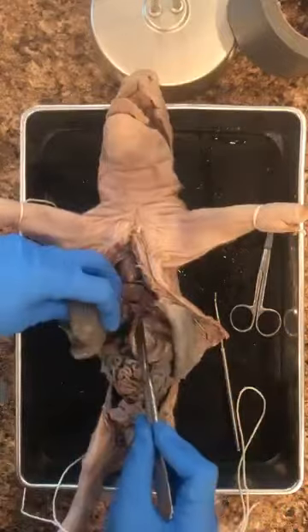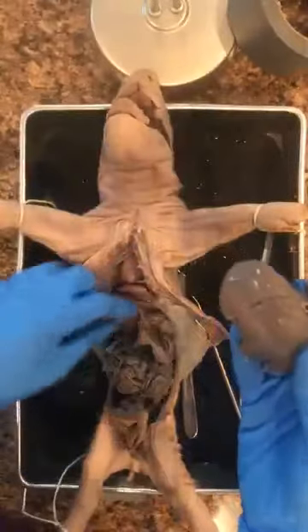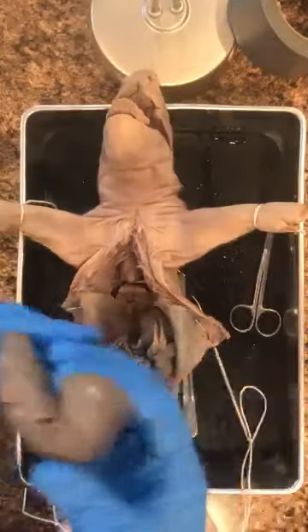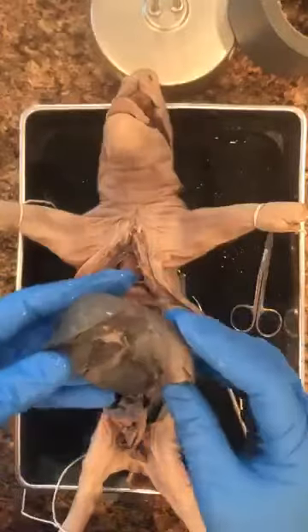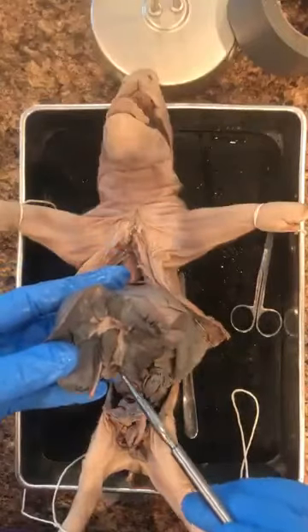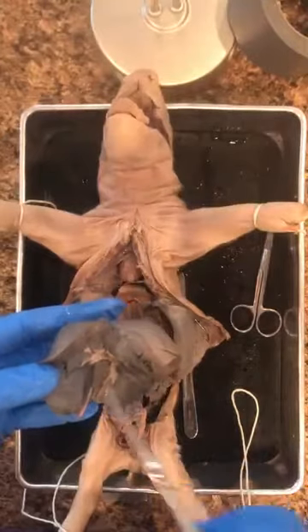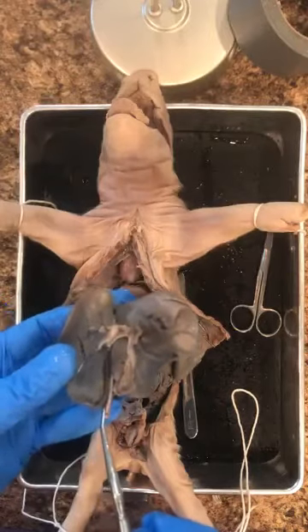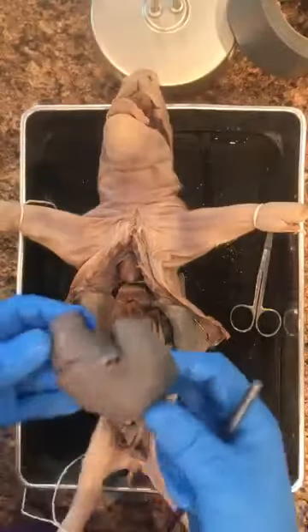Okay, she's almost free. Okay, so here is our liver. Oh my gosh, so stinking cool. Okay. So liver, it's so big, guys, so big. Back here, like I said, is that gallbladder, okay? And these are all the ducts, so it attaches throughout here, okay? This tube, you can see it's a tube, there's a hole right there. That's what was attaching to the umbilical cord. So there is our liver. It's a beaut, looks nice and strong.